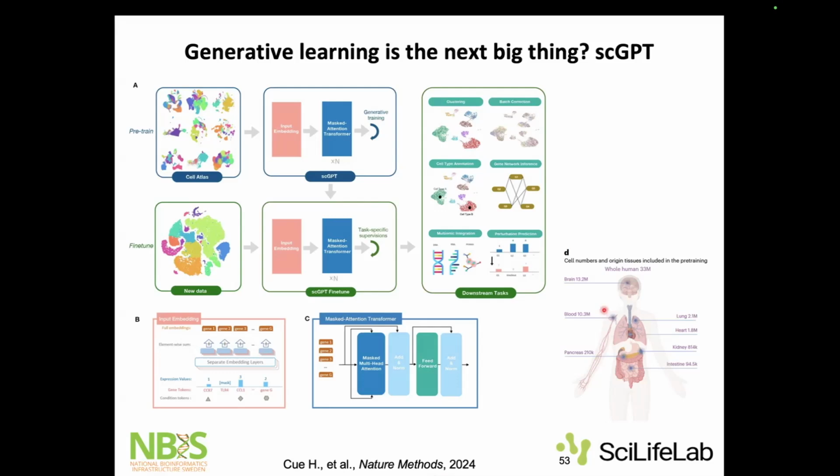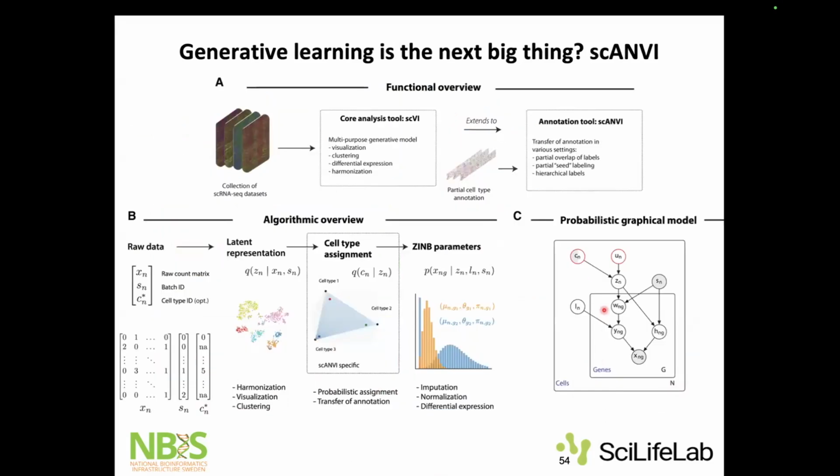I haven't done it myself, so I don't know how it works. In their paper, they say that it performs very well when they compare it with, of course, the similar methods. They do better than the older versions. The other one is SCANVI, and that Nikolai also touched upon in the other lecture.